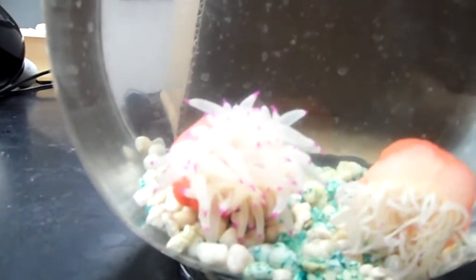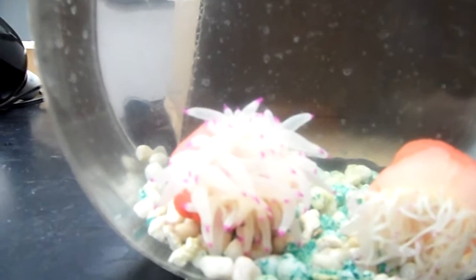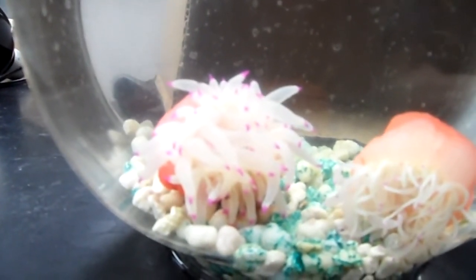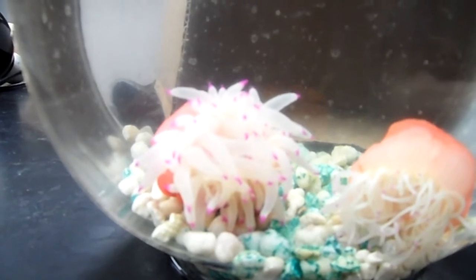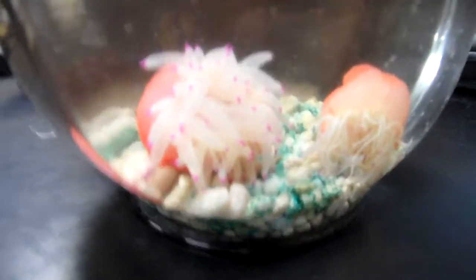And just by turning off the lamp, we've already seen a change in his behavior a little bit. I'm going to let him get comfortable in this level of light before I go ahead and apply the touch experiment. But the idea here is to not only touch the anemone obviously on the tentacles, but also on its body wall and possibly its basal disc to see if there's any difference.